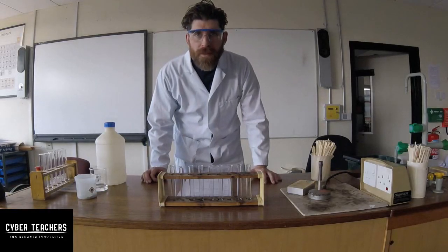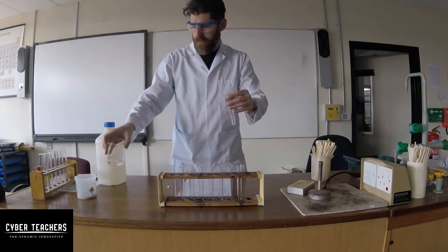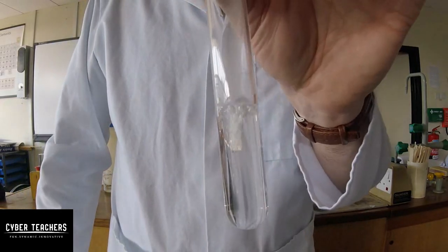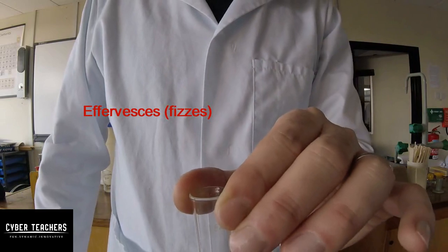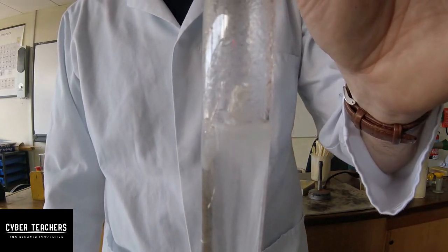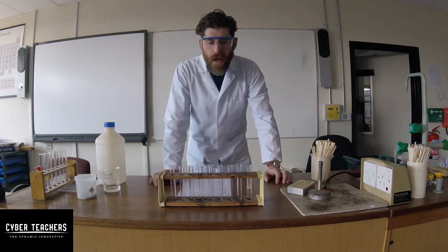Let's see what happens when we put magnesium into hydrochloric acid. I've got some hydrochloric acid and some magnesium — in it goes. You can see it starts to effervesce and there's gas being given off; it's fizzing quite vigorously. Not only did it fizz, it got really really hot very quickly, so there's quite an aggressive reaction going on.